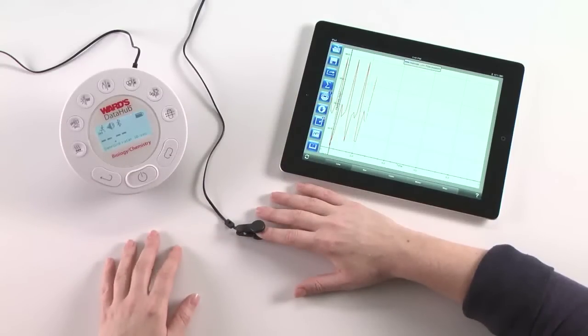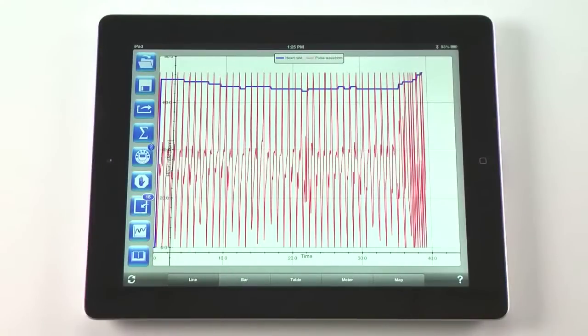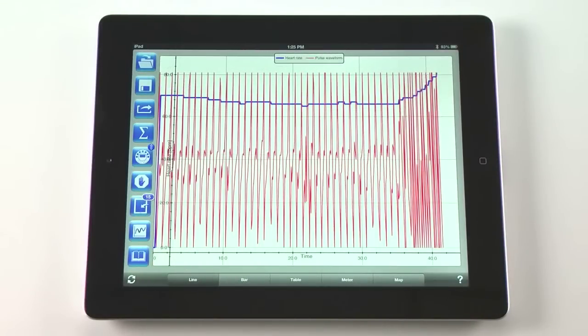We now have the student sit still without talking for 30 seconds. Now our student will do physical exercise for 30 seconds. Watch the live graph as it displays the change in heart rate.